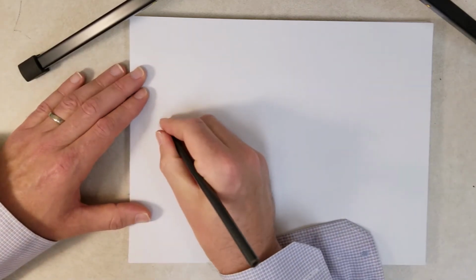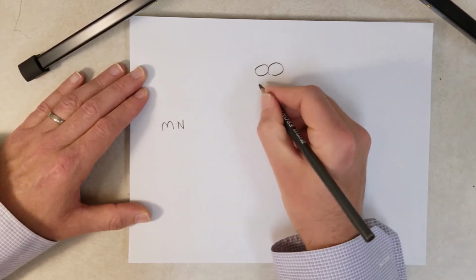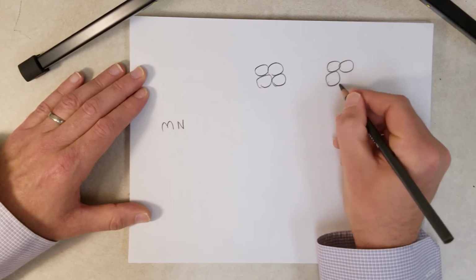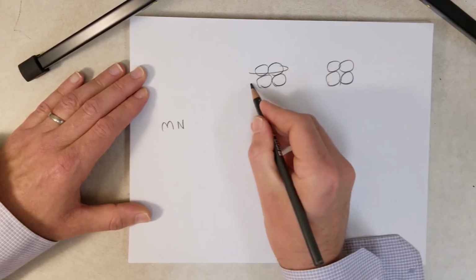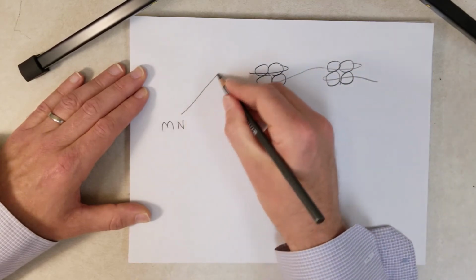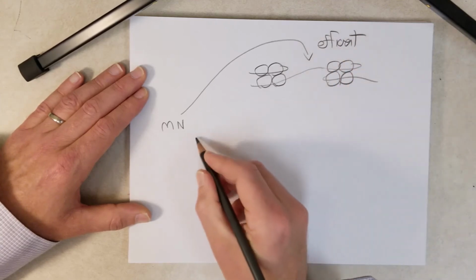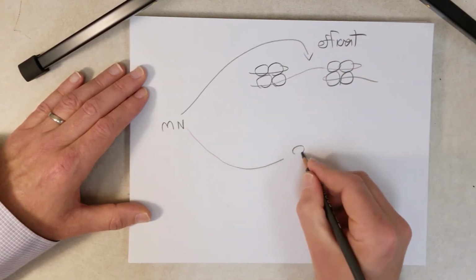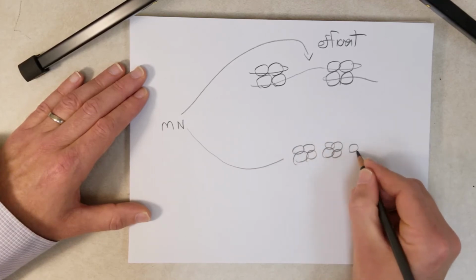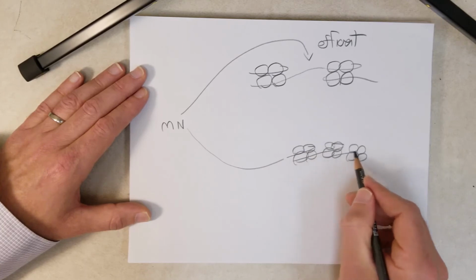One point I should touch on just before we go on, and you might already realize this, because I think we touched on this earlier in the video, is that micrococcal nuclease is going to digest this linker DNA very efficiently. But it's going to digest this DNA with the short linkers, where the nucleosomes are packed really close together, very inefficiently.